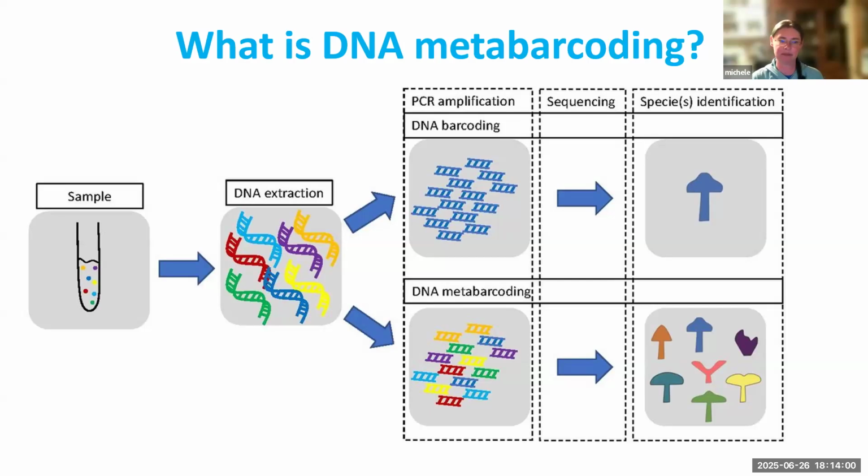In a traditional sample, you're going to have one organism that's either a pure culture or a pure specimen of just that organism in that sample that you're looking at. This is required for traditional barcoding because you can't have mixed organisms in there or you're going to get an absolute garbage mess when you get your sequencing data. It's not going to make any sense. It's going to be all scattered up and mixed up together.